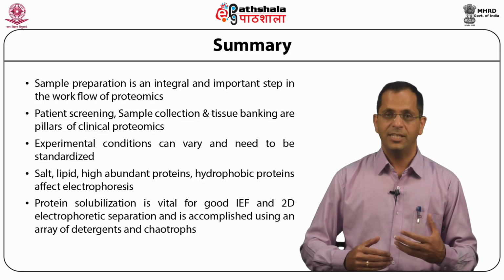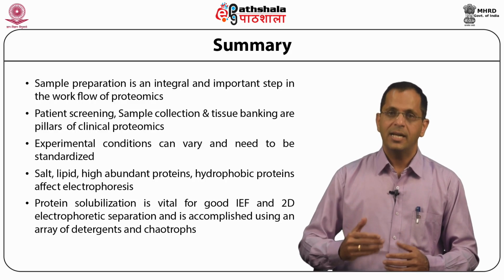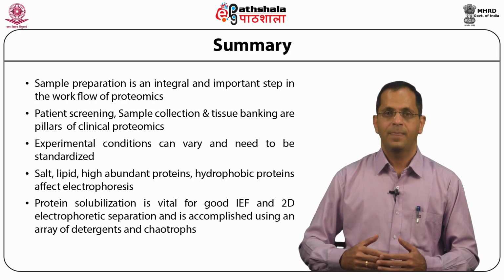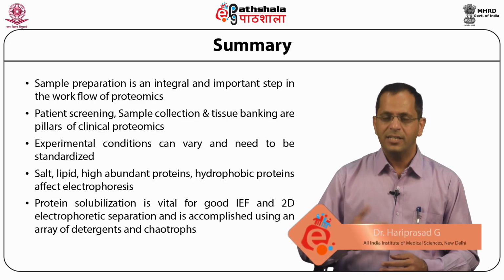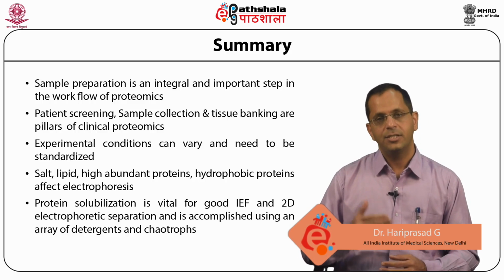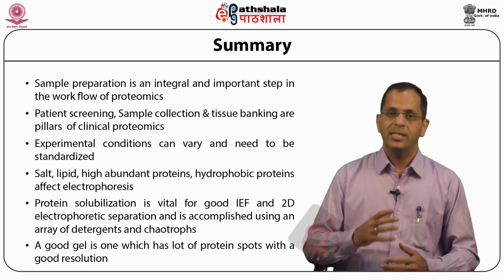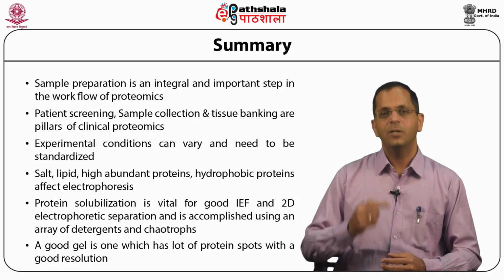Protein solubilization is vital for good isoelectric focusing and two-dimensional electrophoretic separation and is accomplished using an array of detergents and chaotropic agents. A good gel is one which has a lot of protein spots with a very good resolution.